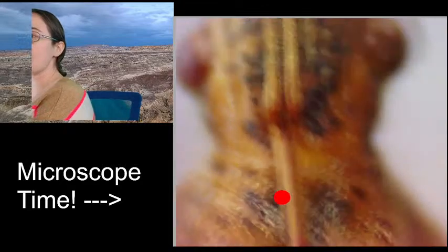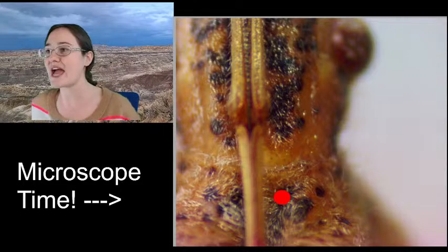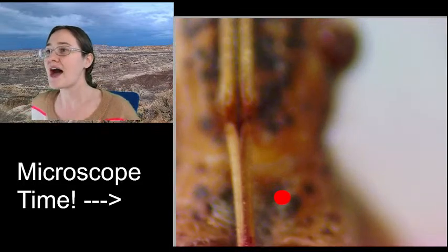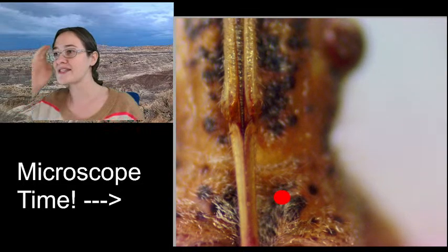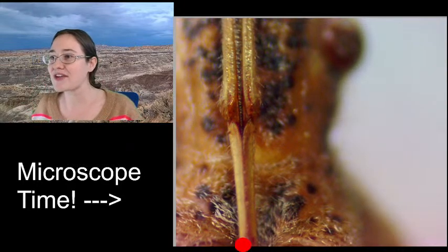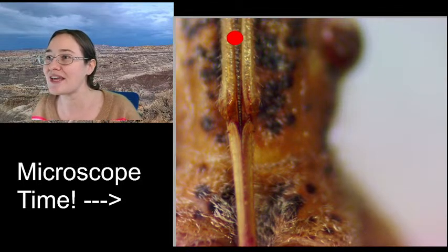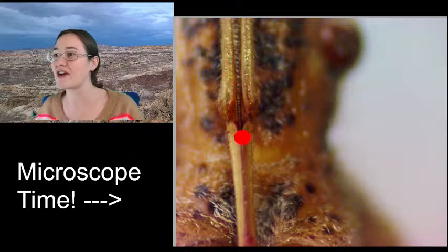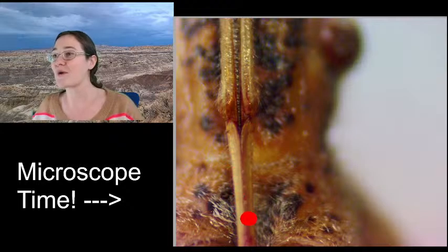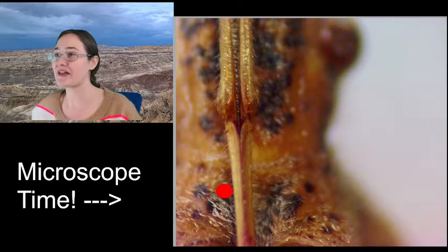So all insects have kind of the same pieces of their mouth parts, but they're all just adapted to do different things. And when we have true bugs, they have this long straw in the center, and then they've got two pieces that kind of help protect that straw. So you can see right about here, the straw gets very thin and narrow, and then it disappears into the shaft, right? And this is what he's using to protect it. So, yeah, that's what his mouth part's all about.